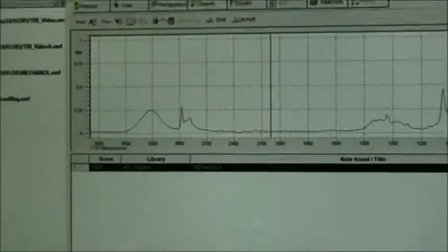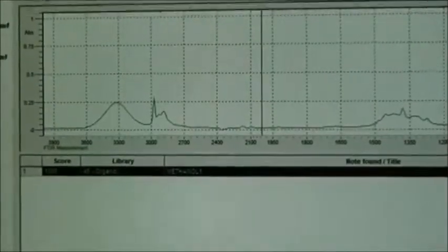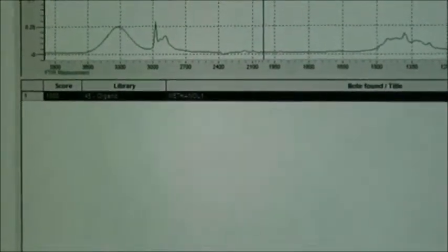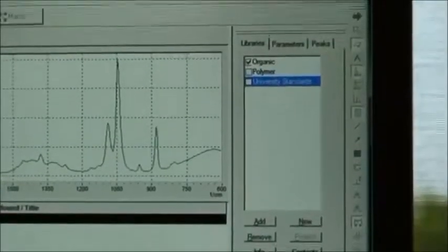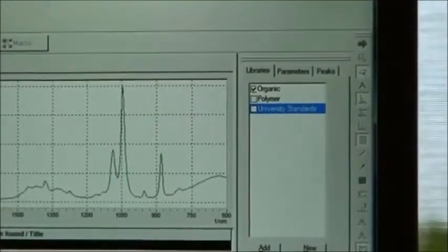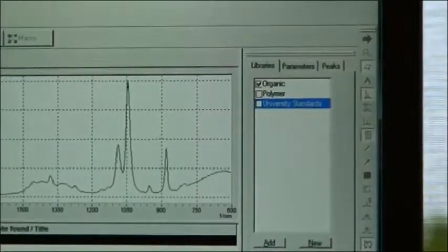It's telling me that it's 100%. That's pretty good. You can also do a peak search. You can search a specific peak. And that's one thing you can do.